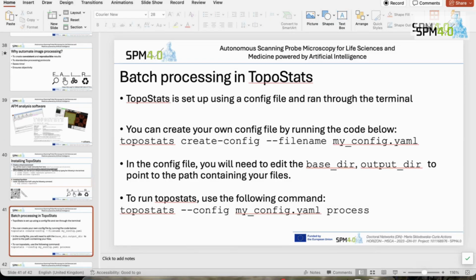That works. It's done. Okay, so then you need to find where that configuration file is. Where is it? It'll probably be where you install it. You might just have to do a search if you can't find it.